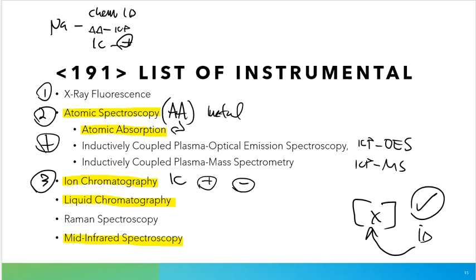That's something I can't quite do with a qualitative analysis scheme, or a few reagents added to drops in a test tube to see what color it changes. That's something I can't accomplish using just those observation-based tests. But with instrumentation, I can. It's not a requirement for the ID category, but I could do it if I wanted.